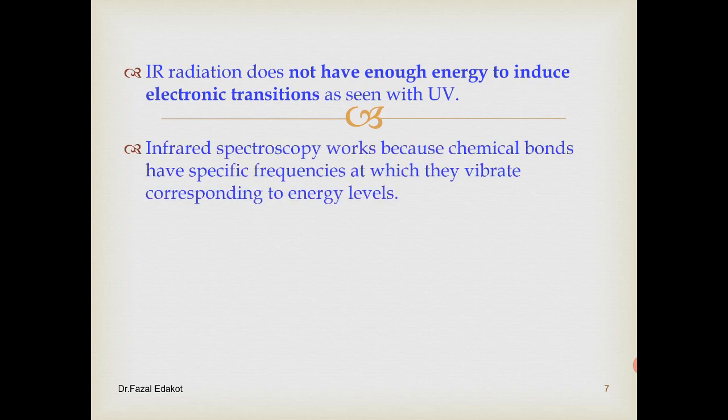Infrared spectroscopy works because the chemical bonds have specific frequencies at which they vibrate, corresponding to the energy levels. Please understand, there is a vibration here. Now what happens if I supply energy?